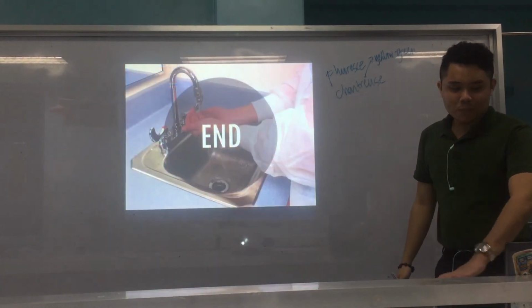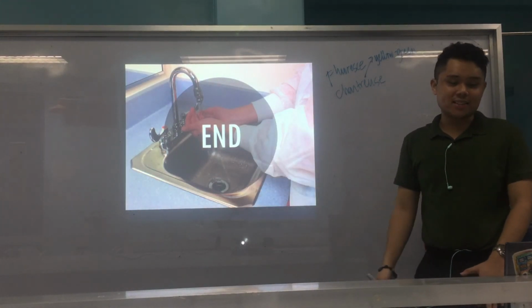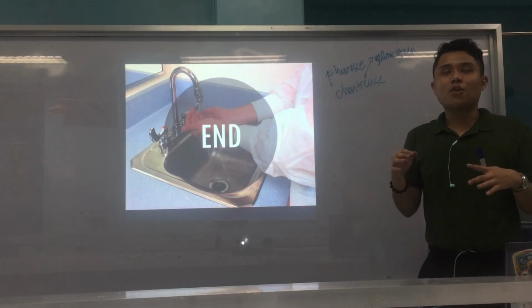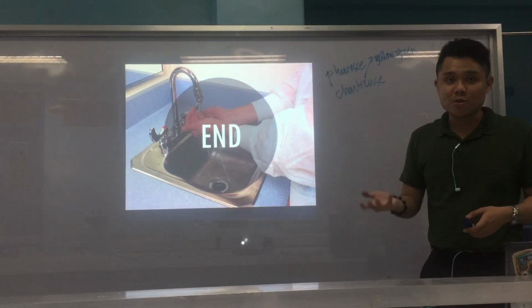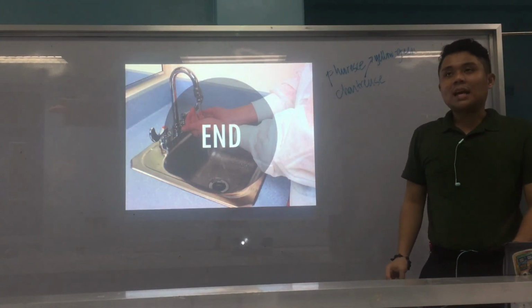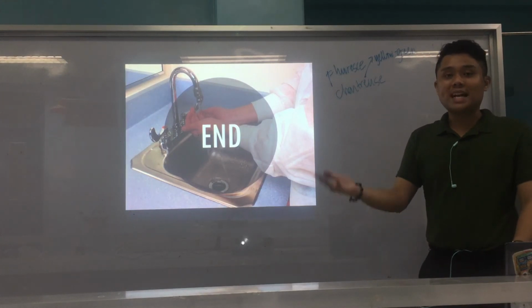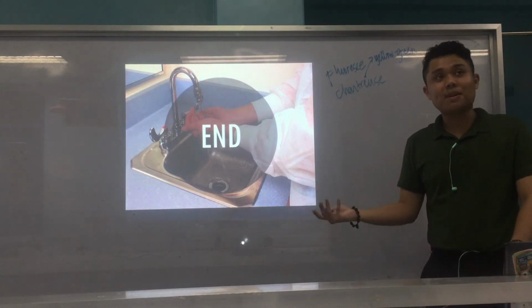So basically, that's it for our stool culture. So as you can see, always wash your hands atong end. We have introduced the pathogens na gyud that may be isolated. So if ever, as you work along, makita niyo mo ng mga characteristics, then of course you perform the necessary biochem tests to identify them. Because as you work along, example na kay stool culture, and then nakitaan sa different plates or culture media, then you perform the necessary biochem to really identify your organism. And then after, AST na pod, to determine the antibiotics that can be used against them.